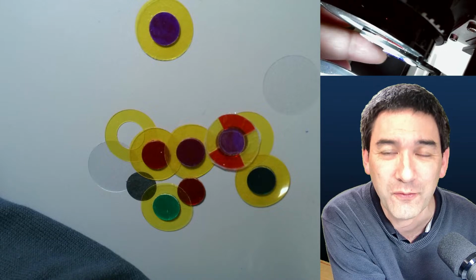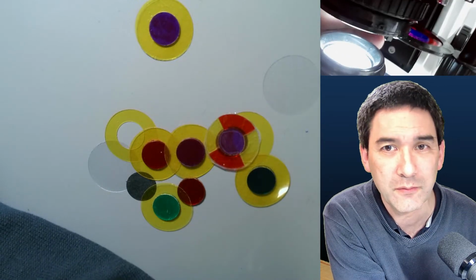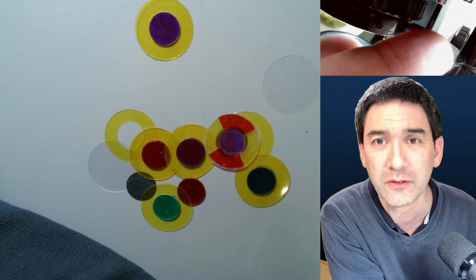It actually was just that the filter was not in place, right? And this filter holder. Yeah, maybe I have to go on the top. Yeah, there is a filter. The filter is in here, right?